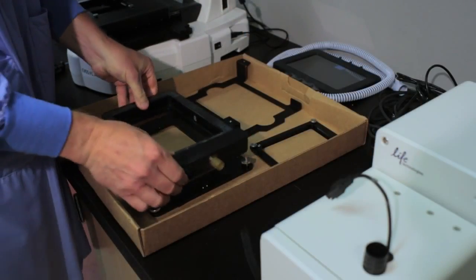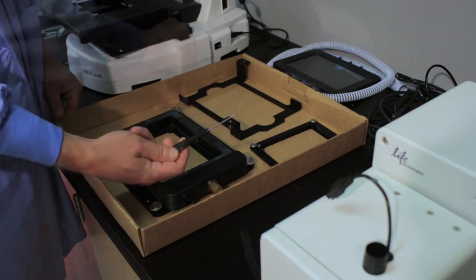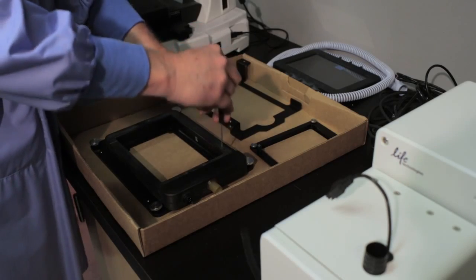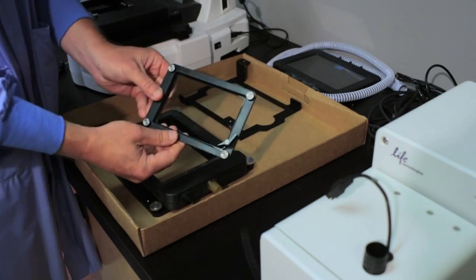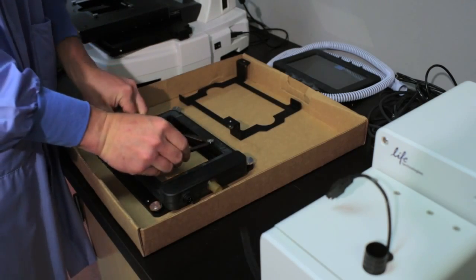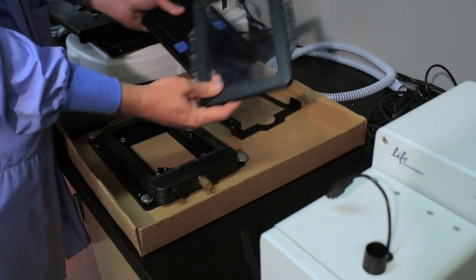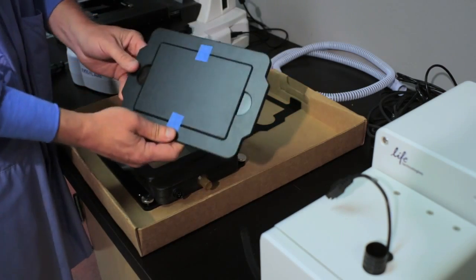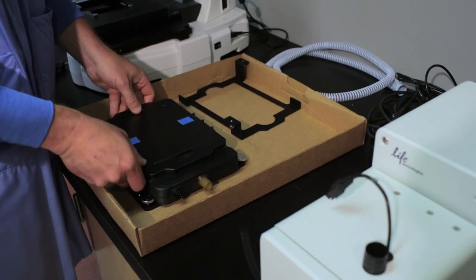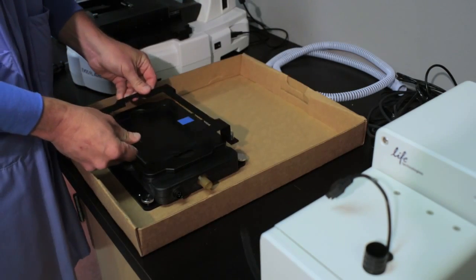Place the incubator chamber on the On-Stage Incubator Master Plate and secure it in place using the four 2-millimeter hex screws. Attach the vessel holder or adapter to the incubator chamber using the four thumb screws. Place the heated glass lid with the no-fog glass window on the incubator chamber. The light shield cover completely blocks any ambient light from entering the environmental chamber and improves image quality in fluorescence imaging applications.